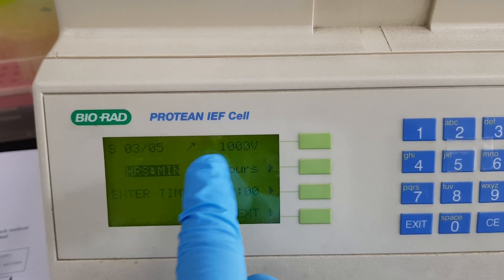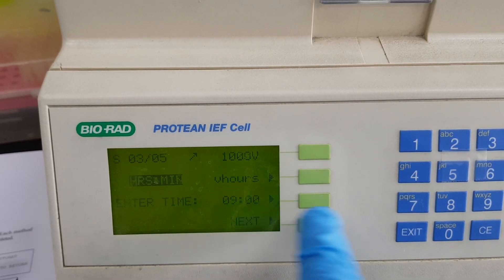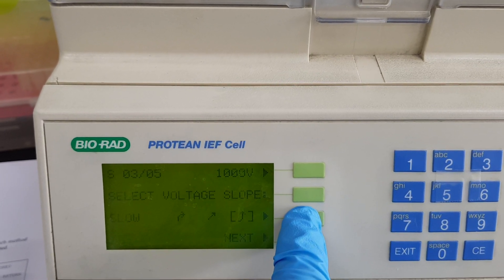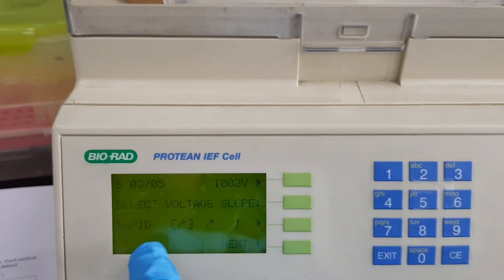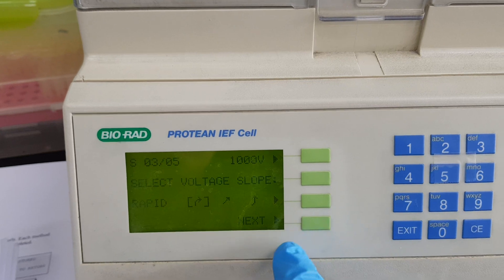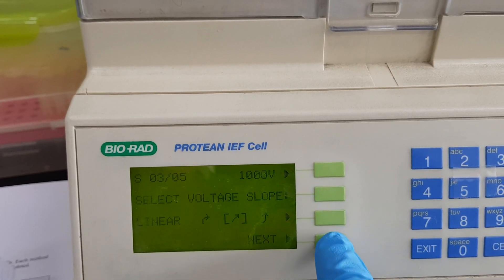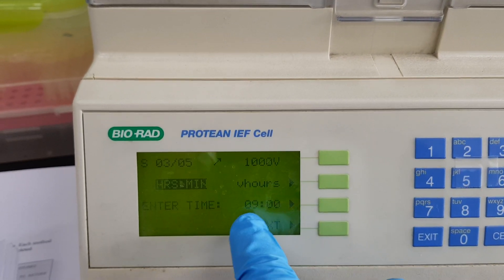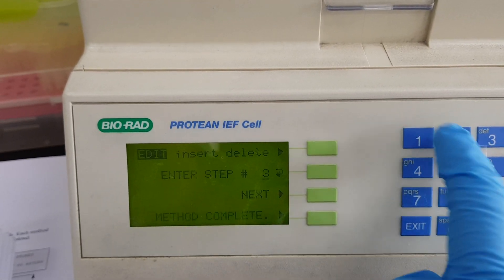For 1000 volt the time is entered in hours and minutes. There are gradient options — slow, linear, and rapid. All my voltages are linear, so 1000 volt is set to linear. I then move to the next screen where 1000 volt is set for nine hours. That completes step three, so I go to next.